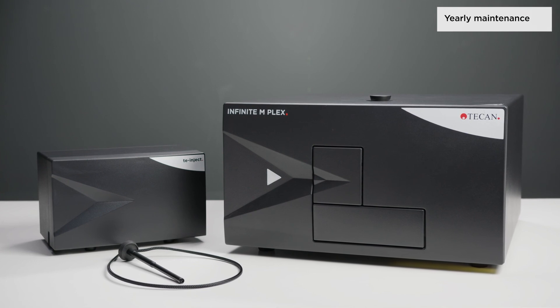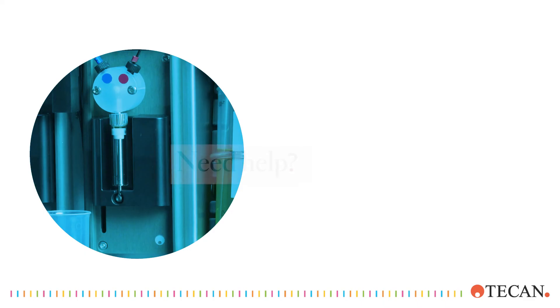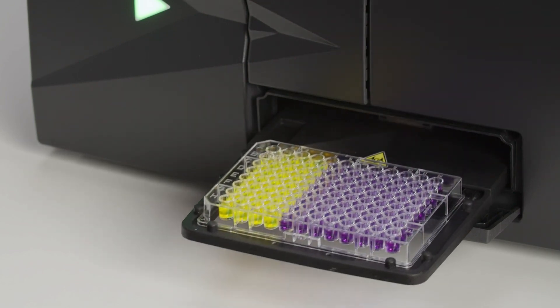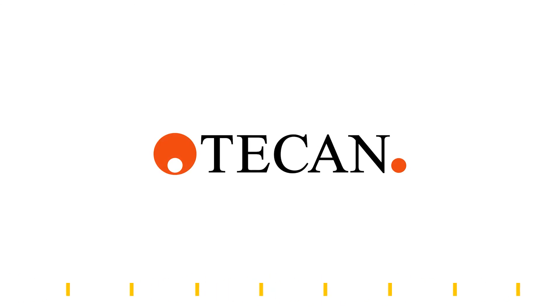During yearly preventative maintenance, your Tecan service engineer renews tubing, valves, and syringes. If you need any further help, please find detailed instructions in the manual or on the USB drive, and please do not hesitate to reach out to our helpdesk experts. Thank you.